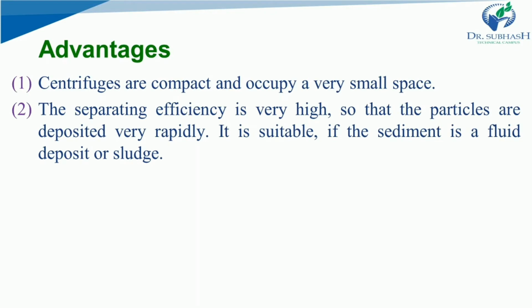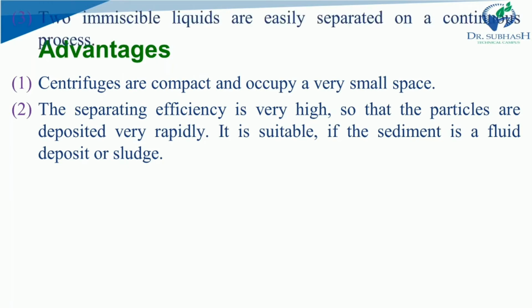It is suitable if the sediment is a fluid deposit or a sludge. The separating efficiency you can really connect, because ultracentrifugation is really important in separating even minute globule size or particle size. Then ultracentrifugation will be really helpful in separation.